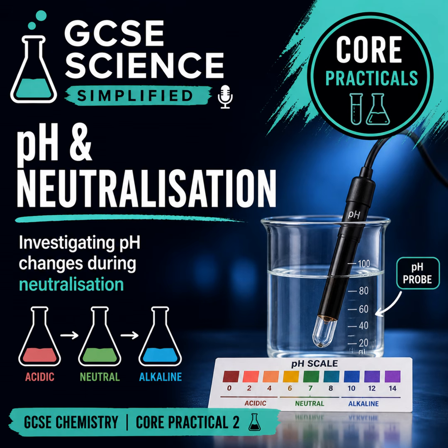How do you know it's exactly neutral? You're looking for pH 7, but here's the challenge. Universal indicator paper is an approximate reading. The pH probe is better. It's more precise. It has a higher resolution. So, let's think like scientists. There are possible errors: not stirring properly, misreading your colour changes, or inaccuracies with your mass measurements.